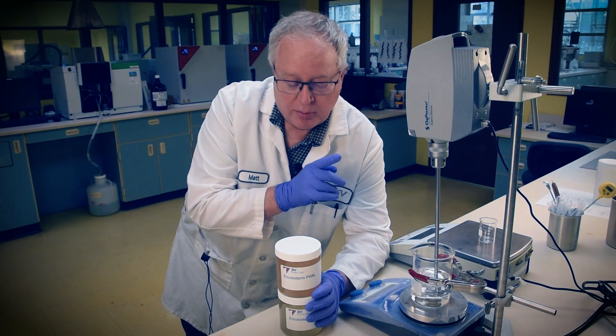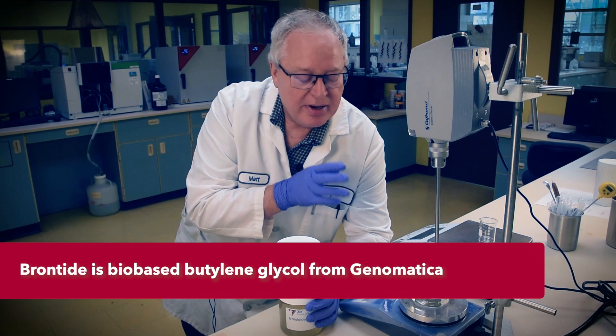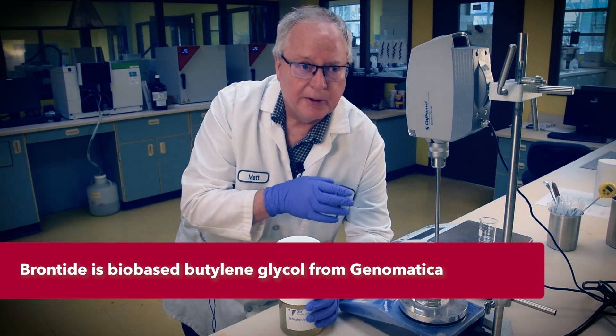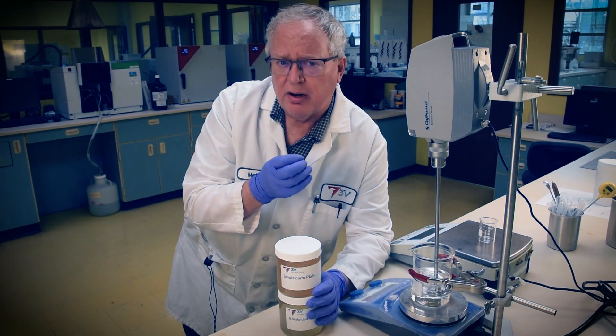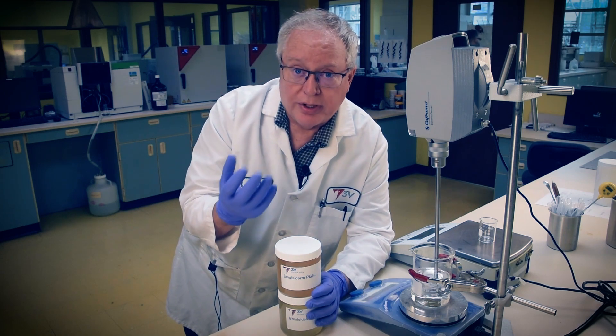Here we have two glycols forming our solvent base. Forty-five percent of our formula is a bio-based butylene glycol from Genomatica called Brontide, a nifty renewable. Fifteen percent is standard dipropylene glycol, which gives the product a firmer structure and a nice sensorial when finished. We're keeping it greener this way.